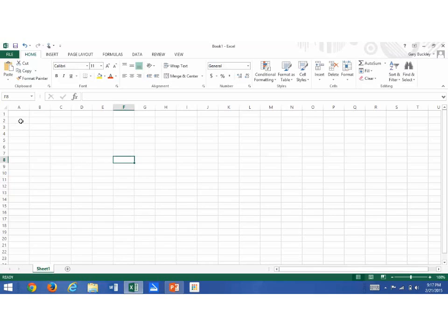I'm going to type in some data that I picked up last spring or sometime or another, and it's calibration data with a hydrometer. So we have a percent sugar where we had 0, 4, 8, 12, 16% sugar. We measured the heights in our hydrometer, and these are in millimeters, although we don't really care much about what those units are. As I put these numbers in, all I do is type in and hit enter, and it goes from there. You can cursor around wherever you want in the screen, and everything's fine.